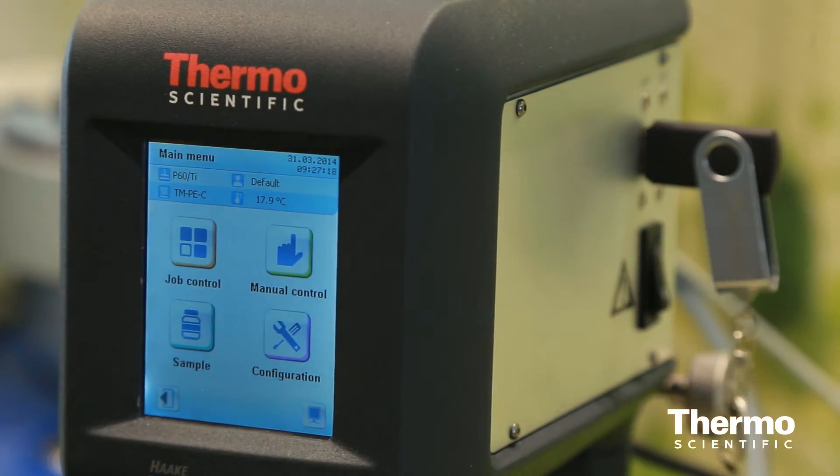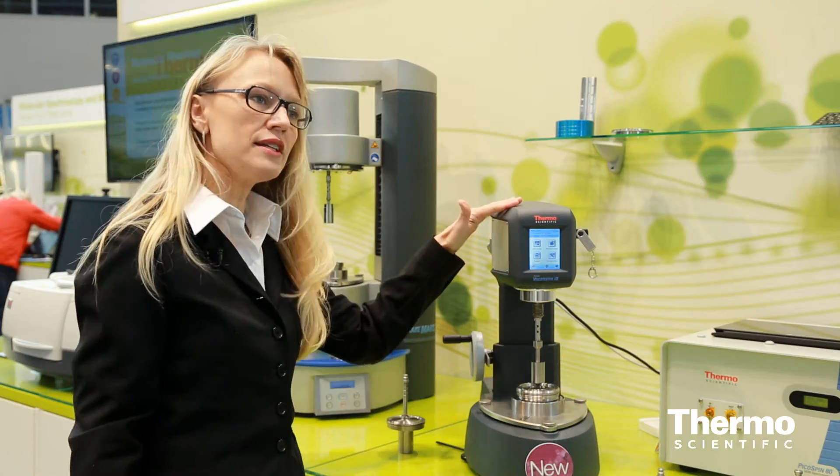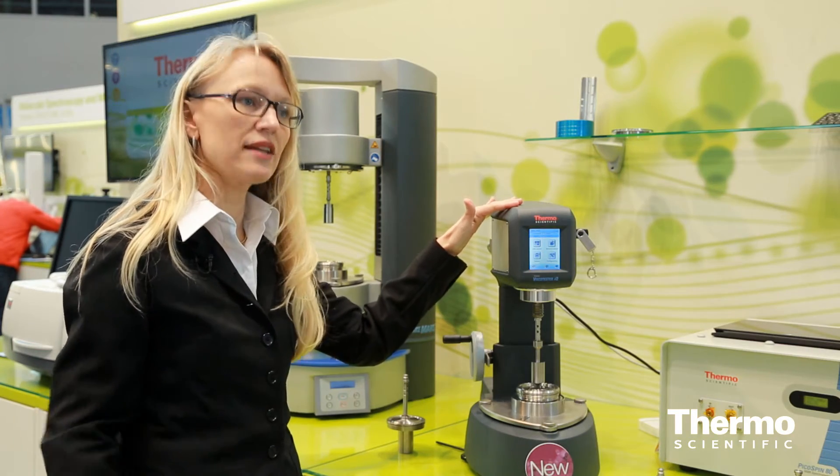Version number two is using the Haake Visco Tester IQ Reo app for convenient editing of jobs and configurations. You can download all the data measured with the instrument to the computer.